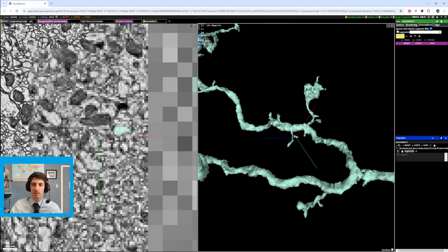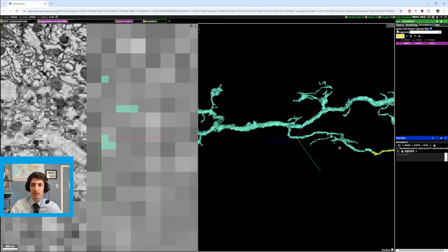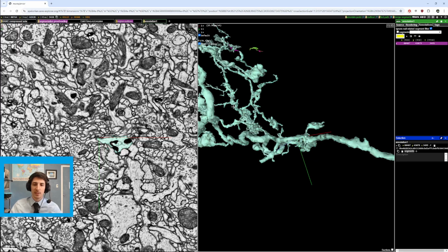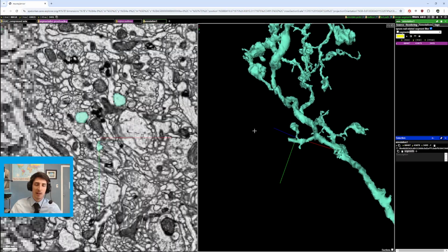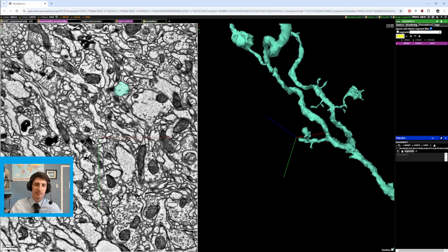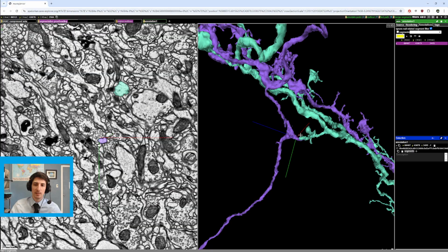So we have a couple of little branches here, but those are a little bit too little. This one I thought was pretty good, obviously. That's why I investigated it. But that kind of only leaves this branch, but it has this little thing on it, which made me not really want to check it in the beginning. But once you do check, I believe it's one of these two here.